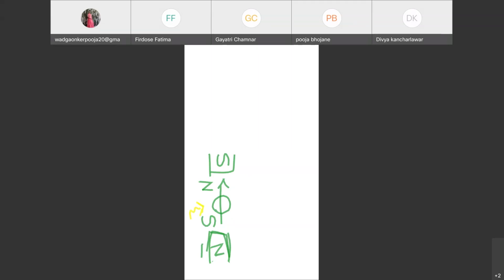अब ये रेडियो वेव्स जब आप डालते हो, तब आपके इस न्यूक्लियाई को मूव होने के लिए, रोटेट होने के लिए, जो कुछ भी अप्लाइड मैग्नेटिक फील्ड है, वो अप्लाइड मैग्नेटिक फील्ड तो आप बढ़ा सकते हो, या फिर ये जो रेडियो फ्रीक्वेंसी है, ये रेडियो फ्रीक्वेंसी चेंज कर सकते हो. एम आई गेटिंग क्लियर गाइज? लिसन केयरफुली. अब आपको ये एनएमआर स्पेक्ट्रा मतलब कि कुछ आपको वहां पर लाइंस मिलेंगे, पीक्स मिलेंगे. तो वो कैसे पीक्स मिलेंगे वो समझने के लिए अब देखिए यहाँ पर हम दो चीजें कर सकते हैं.